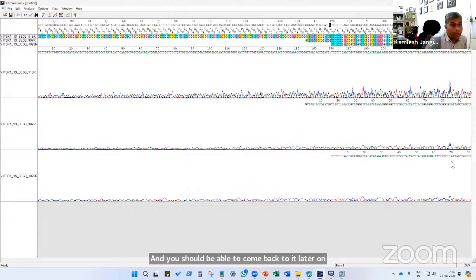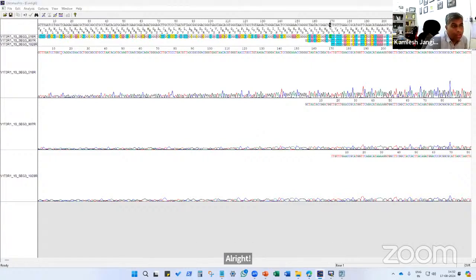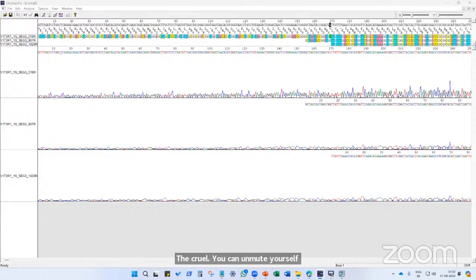All right. So we have a question from Zikrul. Zikrul, you can unmute yourself and ask the question. Yes, sir. Should we push the reverse button before saving the file on the Finch TV, or after we put it into the Chromas Pro?